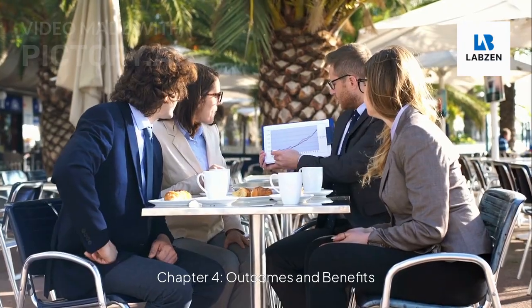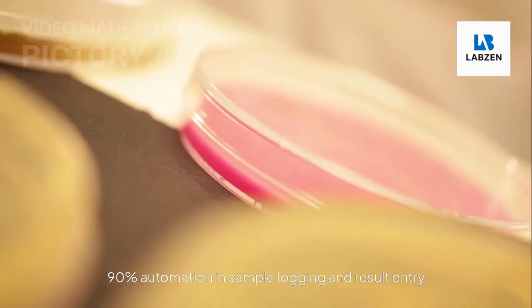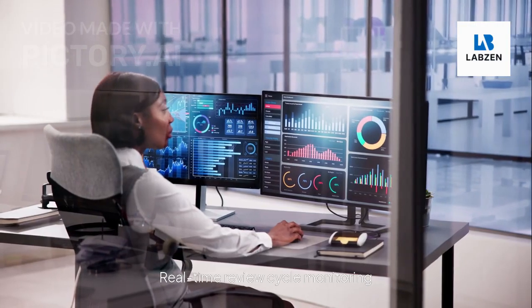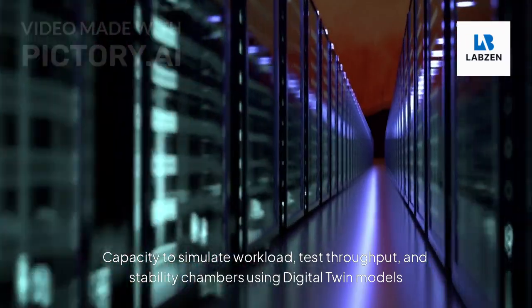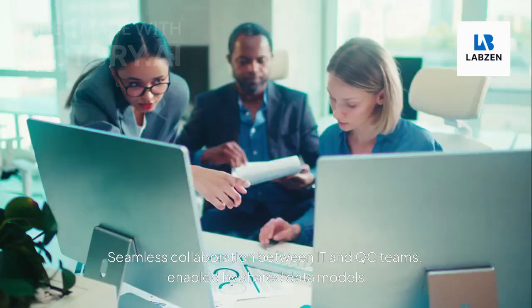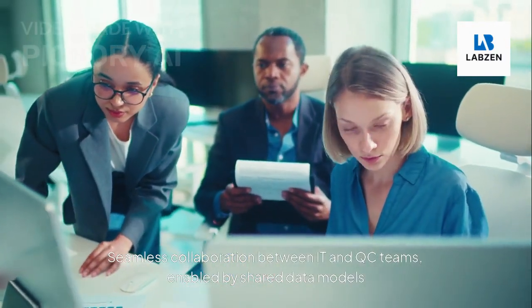Chapter 4, Outcomes and benefits after transformation. Case X now operates with 90% automation in sample logging and result entry, real-time review cycle monitoring, no audit findings for data integrity in 2 consecutive inspections, capacity to simulate workload, test throughput, and stability chambers using digital twin models, and seamless collaboration between IT and QC teams, enabled by shared data models.